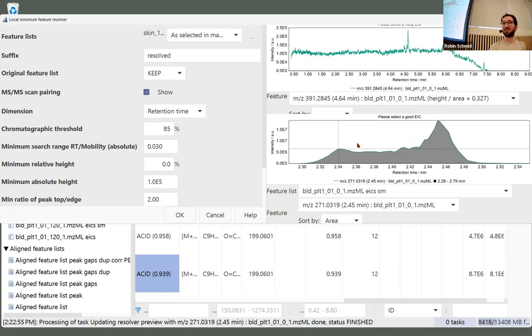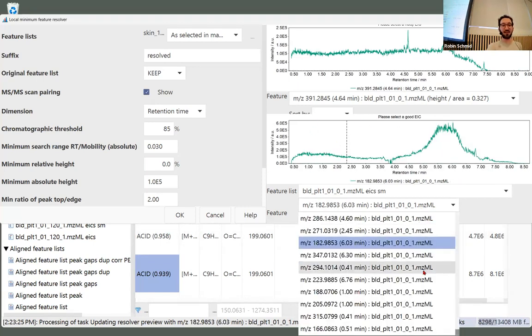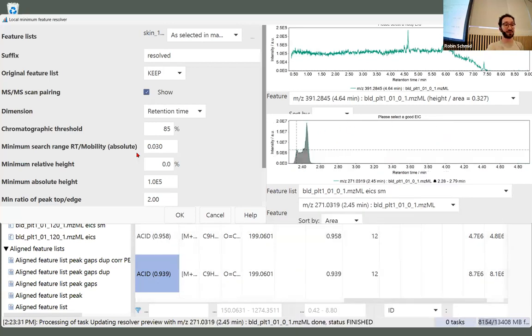It's very hard to tell, right? But at least it's good to just look at a few different examples and then see what happens to them if we change those parameters. Typically we change this one and usually keep it at like 80–85%, because more data we don't expect.